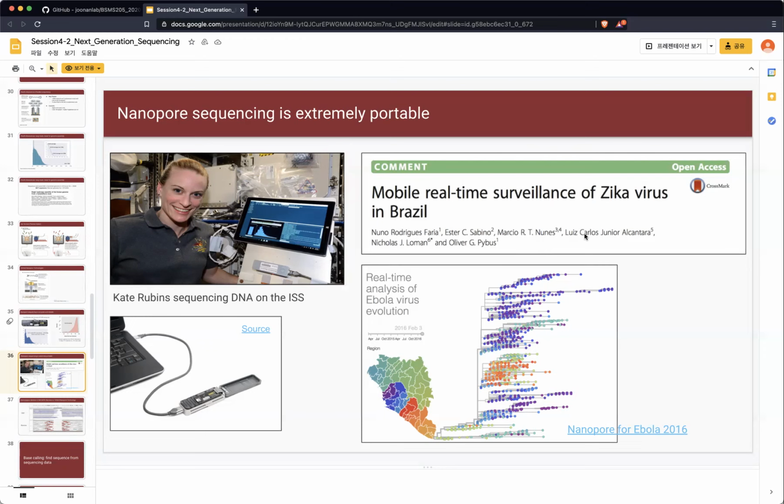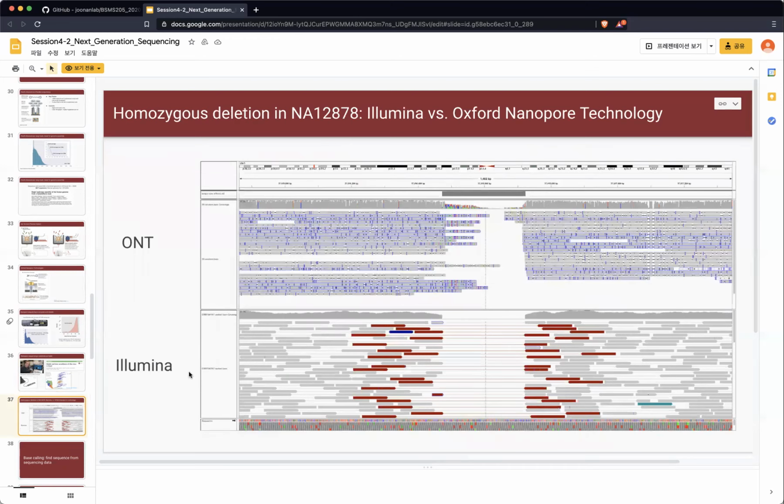But yeah, okay. Some virus researchers also use the Nanopore to search for virus sequences as well. And if you have longer sequences, then obviously you can read out large genomic changes more specifically. So if you use Illumina sequencing to read out, say, a 100 base pair deletion on the genome, this is quite messy. This is the reference sequence, and these are the reads, about 100 or 150 base pair reads, right? And you get the missing position here because the homozygous deletion happened at this position.